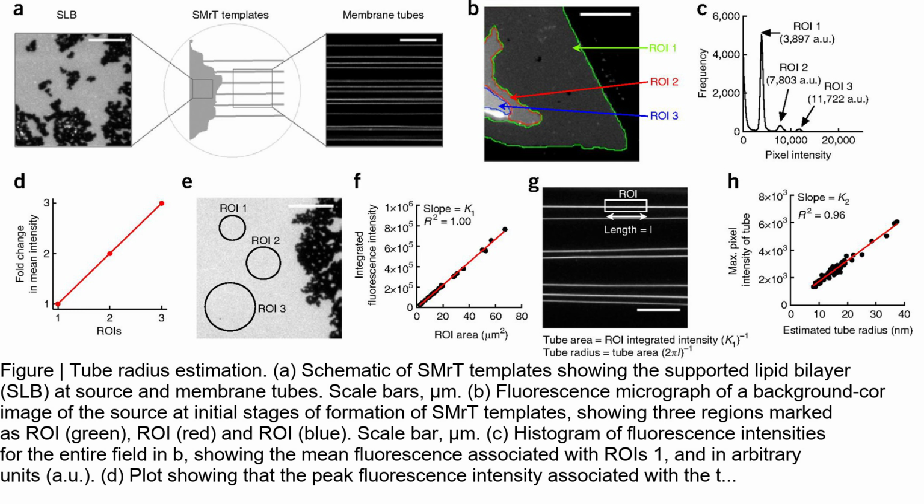The range of tube radii observed in a single preparation highlights the ability to generate membrane surfaces with variable degrees of curvature. This is important for studying membrane remodeling reactions and membrane fission, as it provides a platform for analyzing the effects of membrane curvature on these processes.